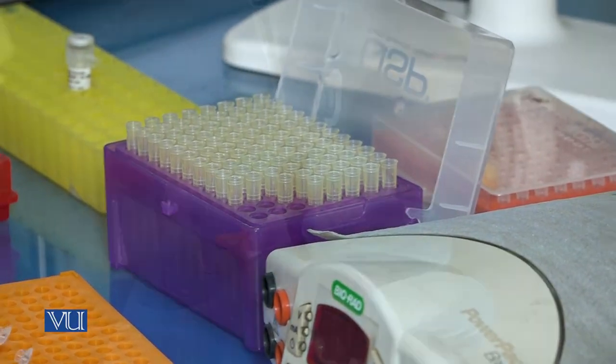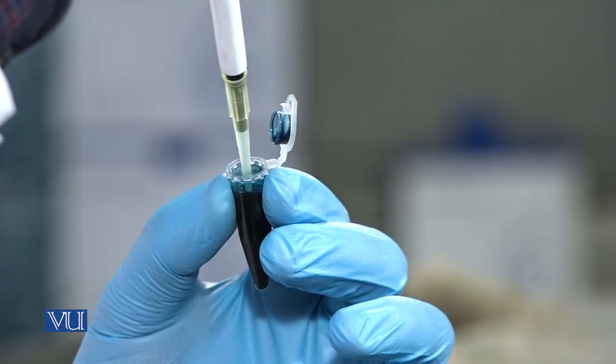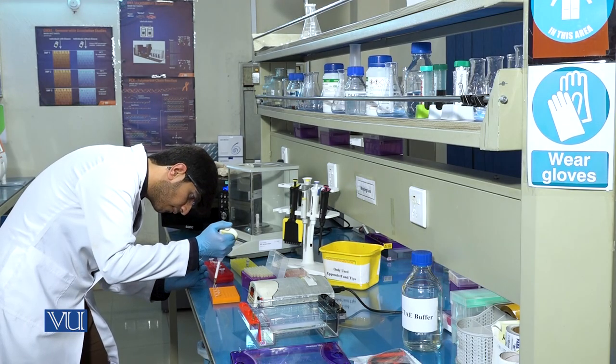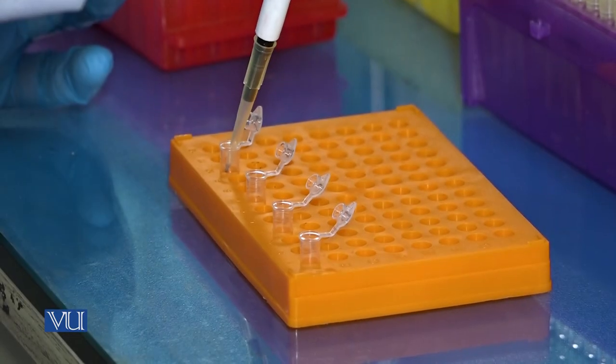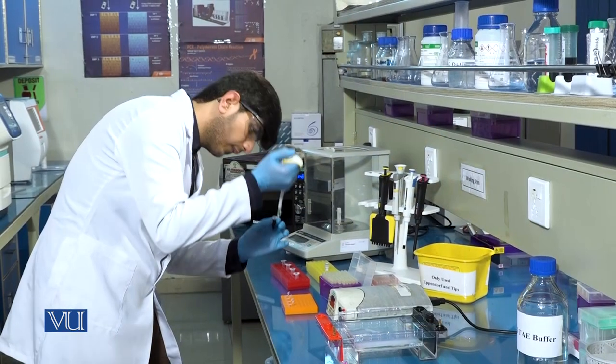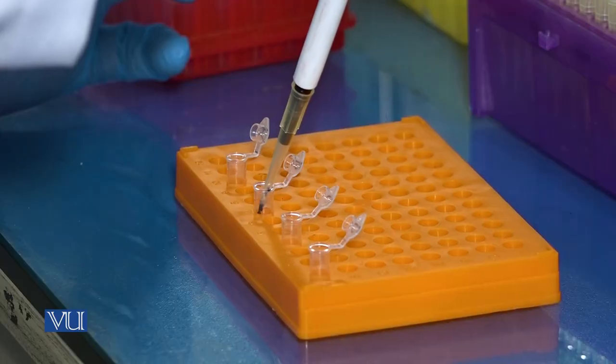For gel loading, 2 to 3 microliters of 6x loading dye and 4 to 5 microliters of DNA template will be taken in PCR microfuge tubes.